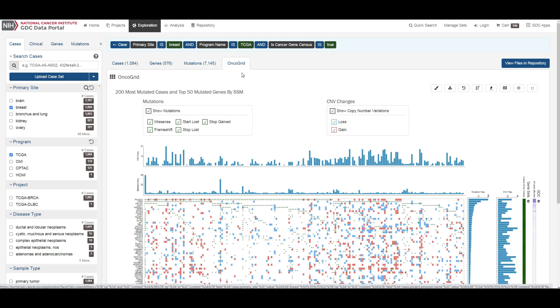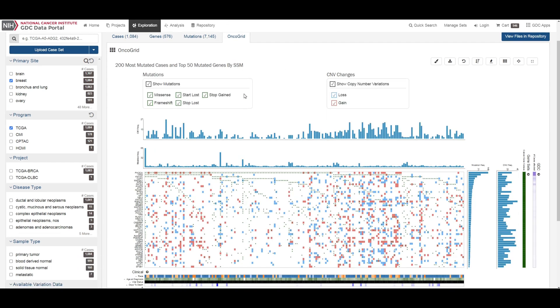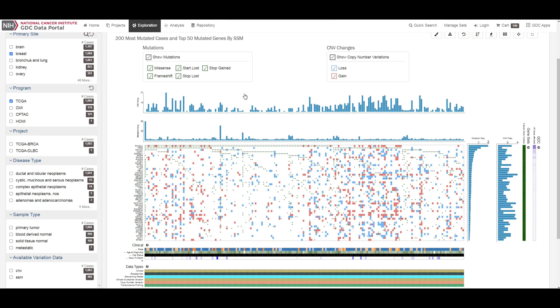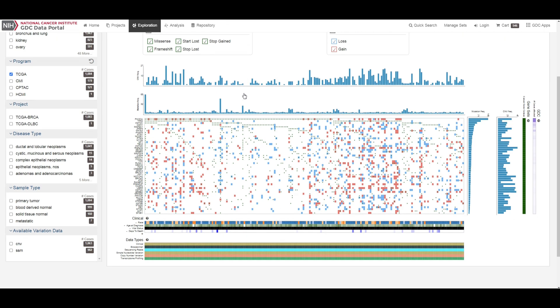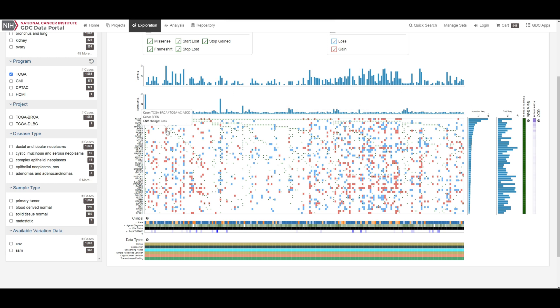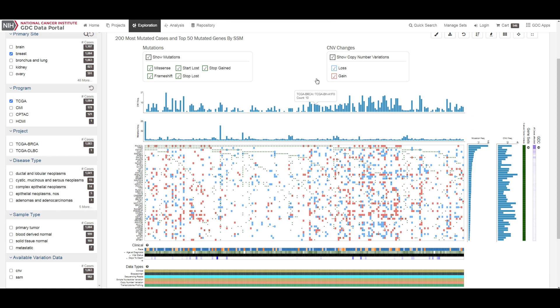The exploration page also includes an oncogrid plot of the cases with the most mutations for the top 50 mutated genes affected by high impact mutations. Genes displayed on the left of the y-axis correspond to individual cases on the x-axis. Additionally, the plot also indicates in each cell any CNV events detected for these top mutated cases and genes. The grid is color coded with a legend at the top which describes what type of mutation consequence and CNV event is observed for each gene and case combination.